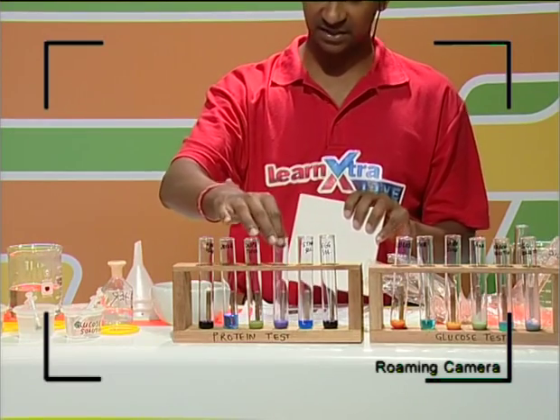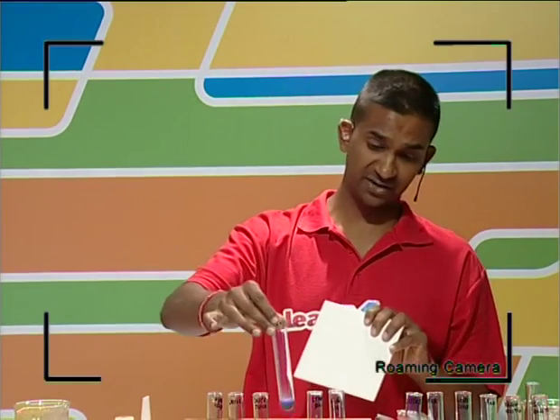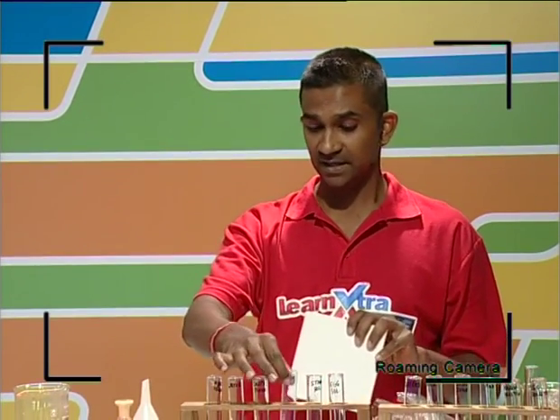Here we've got milk, which is a lavender color, not exactly a lilac color, more. I'm not very good with colors, you can see that, Andy. But yeah, lilac was good.